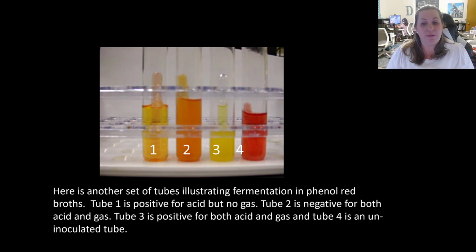Number 2 is going to be negative for both acid and gas because it didn't turn enough. It's more of an orange color instead of yellow, so it did not turn enough. Now, given more time, it might, but we're not sure. Tube 3 is going to be positive for both acid and gas, so you can see that it turned a bright yellow as well as having the gas in the tube.